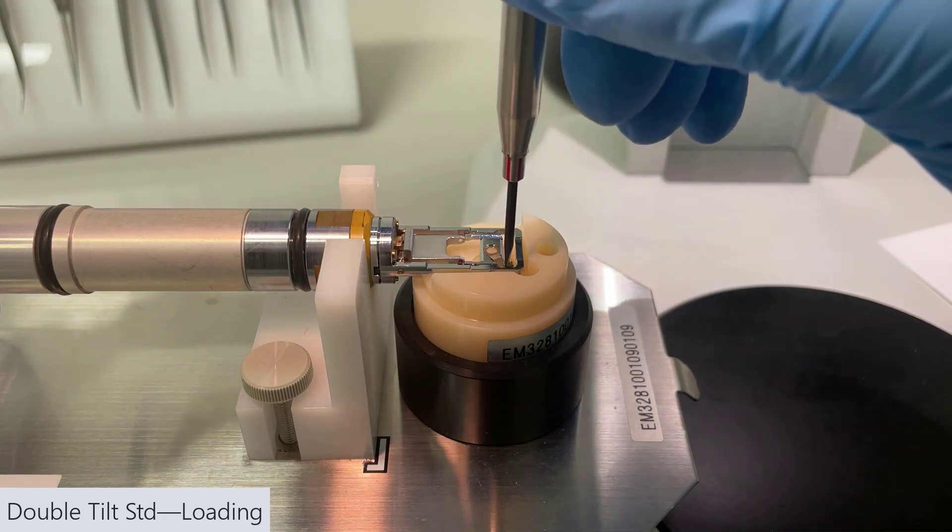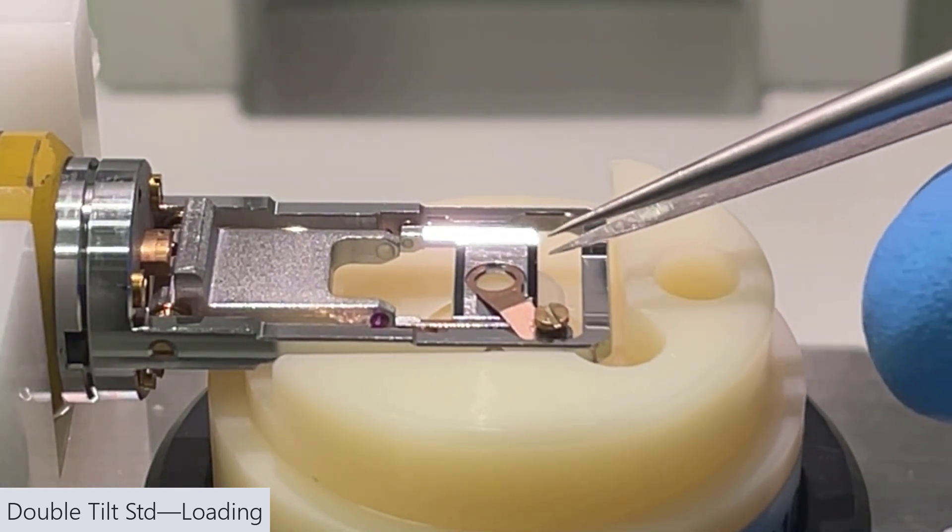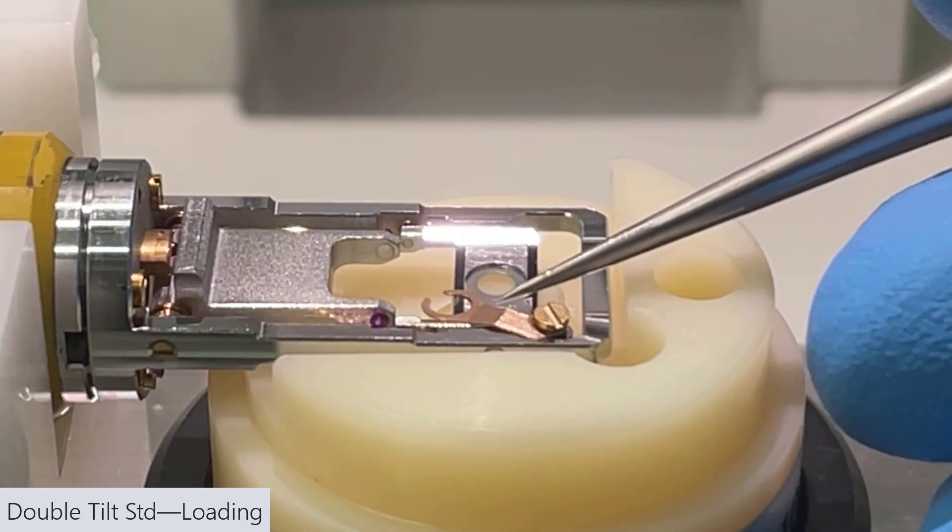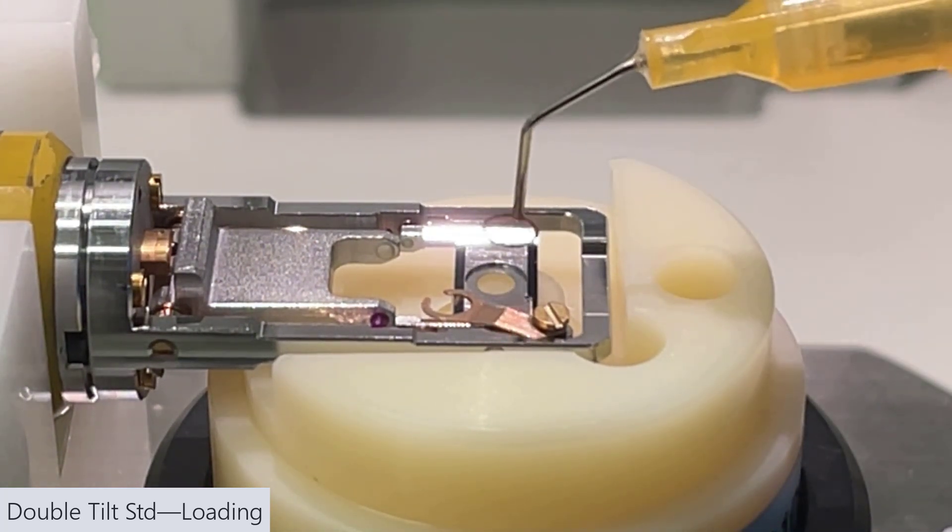In this case, we only have one screw. We're going to loosen that a few turns. Use some sharp tweezers to just move it out of the way. Then we'll bring in our sample and drop it in place.